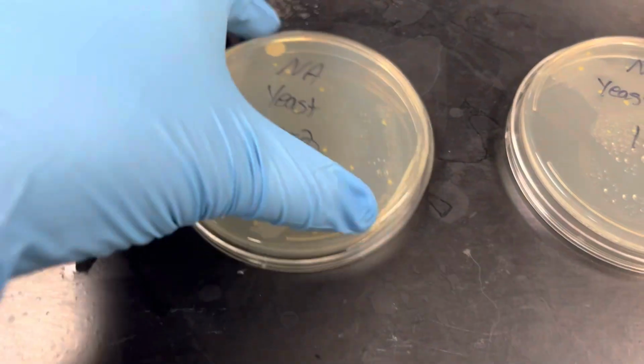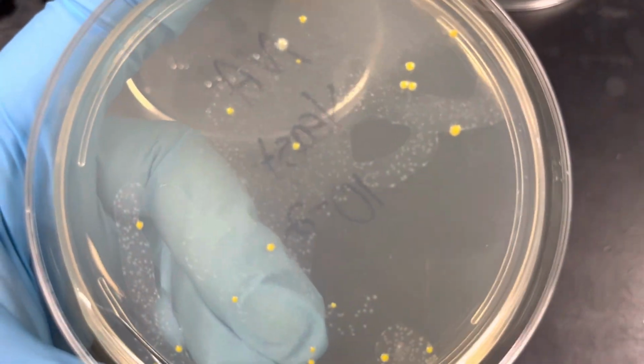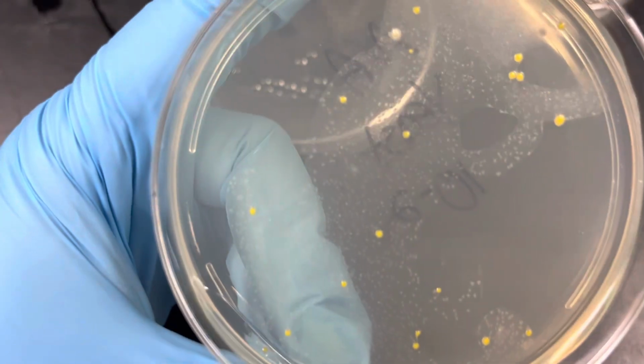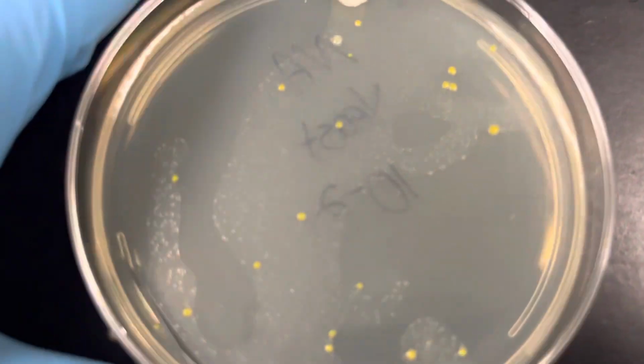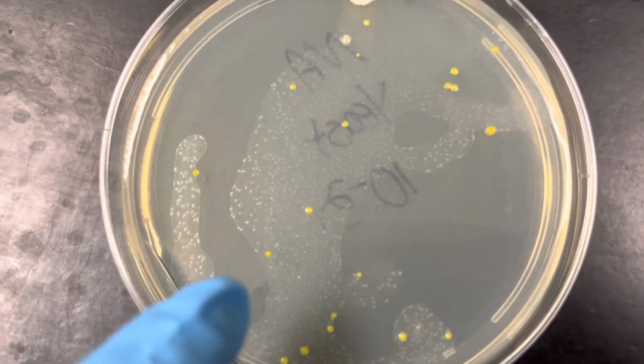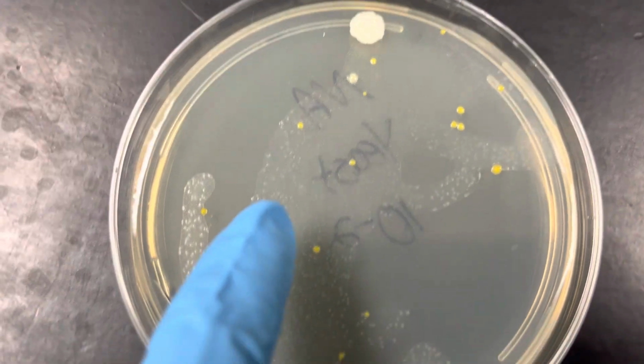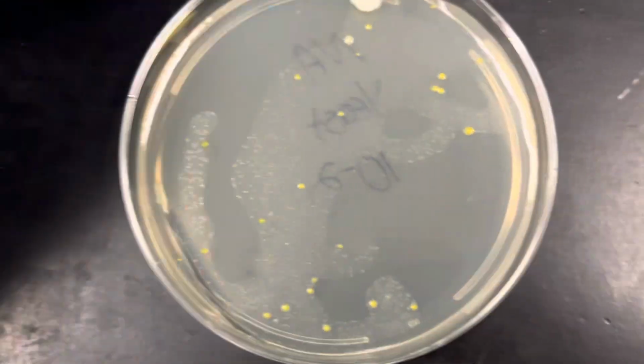That's the yeast. So now if you look at the 10 to the -2, you can see that we still have a film, but you're starting to see a little bit of separation of the colonies. Now this is still too numerous to count, but this really shows you that you're looking at very clear little speckles, colonies. Nothing yellow, nothing white, the translucent.